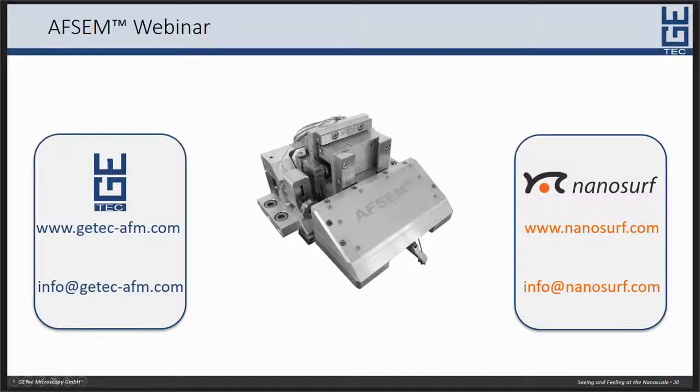Okay, another question is, would it be possible to differentiate between two materials in the same thin film, like tin particles and tin oxide particles? This is a tough one. So if you have two different phases in your sample, and they might not show any change in topography, then what you might want to have a look at is the AFM phase.